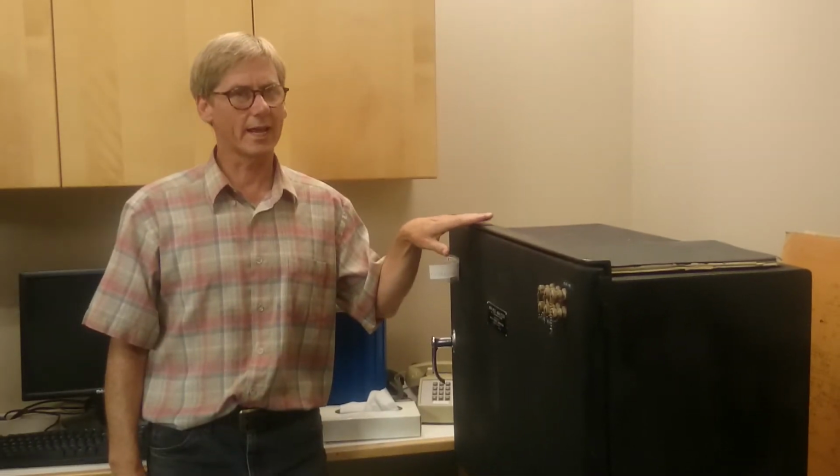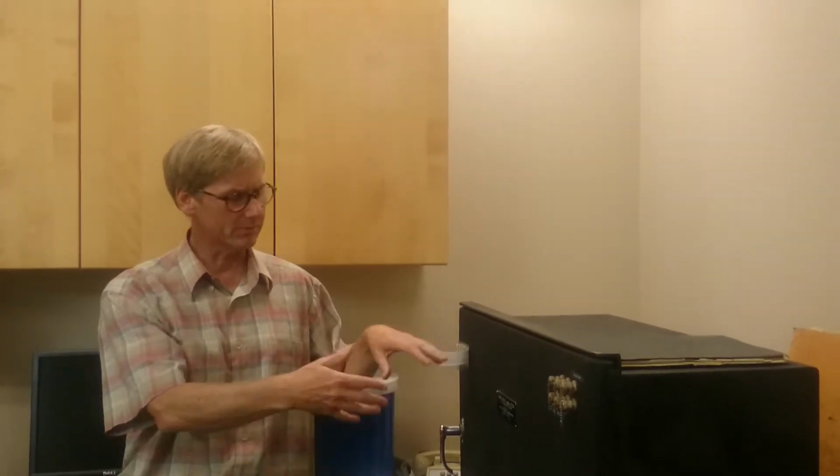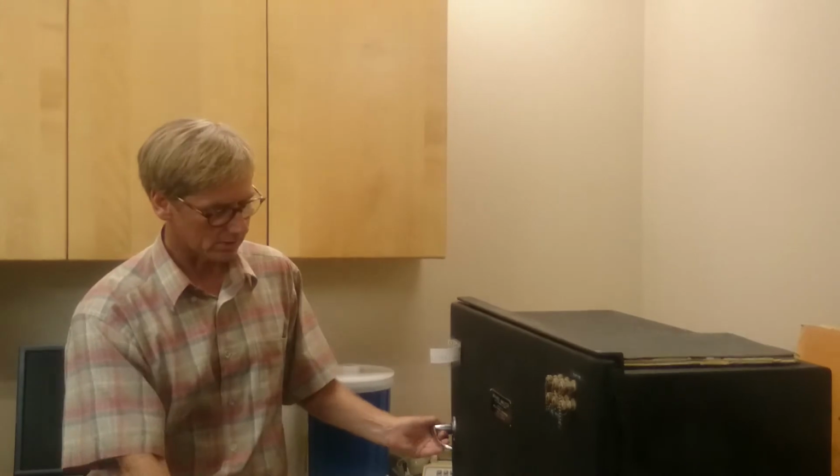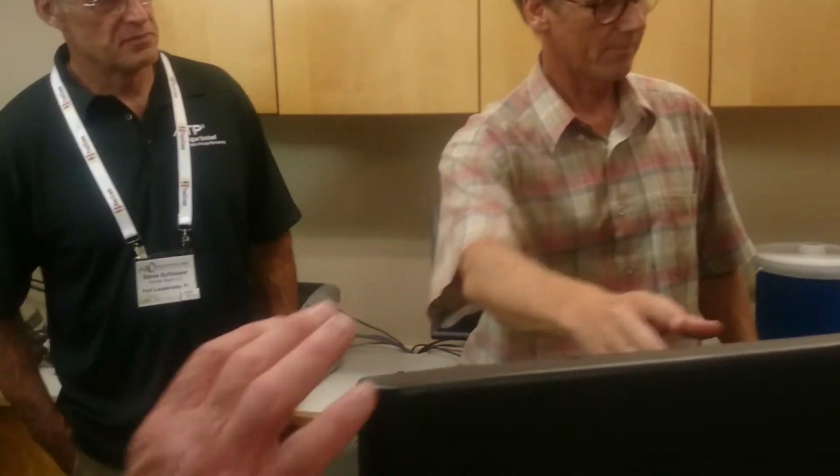For a short time, he had an analyzer running at the South Pole, and he also set up one in a place called Little America on the coast of Antarctica, not too far from Murdoch. But that one failed. The pumps failed. So this analyzer, it's like you look under the hood of an old car. The thing that strikes you is how little is there. So a lot of empty space.